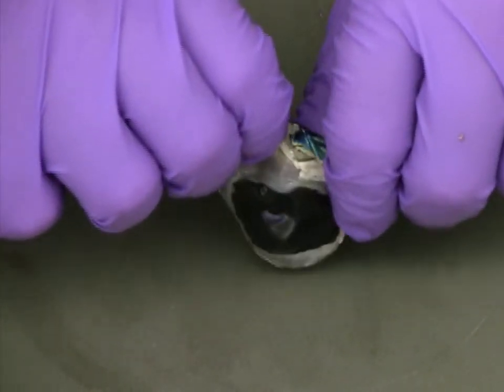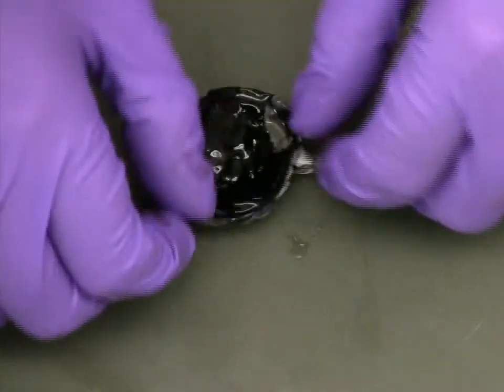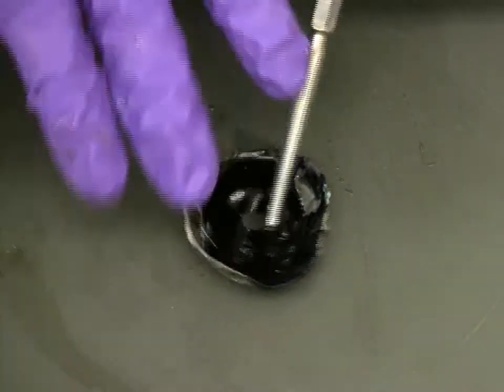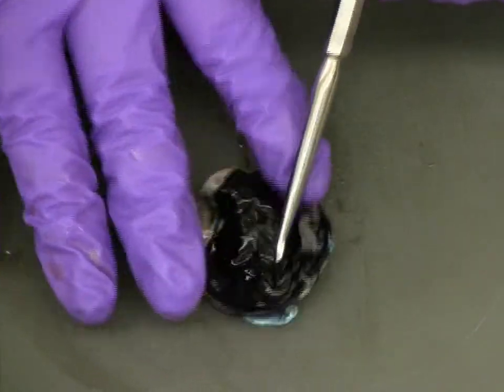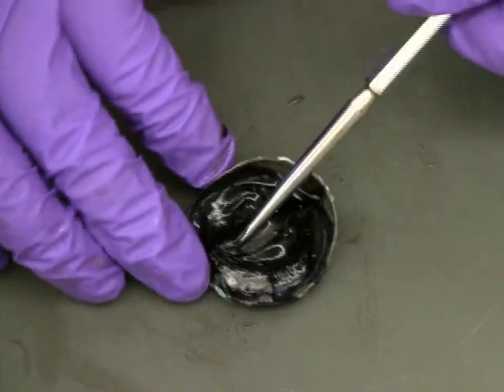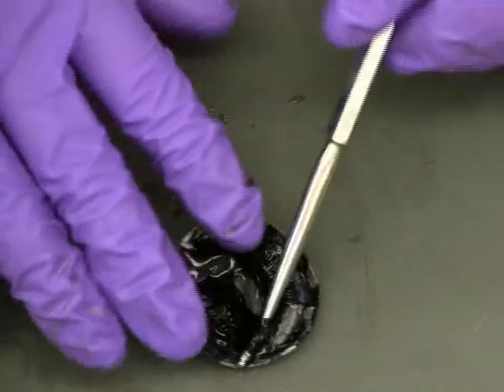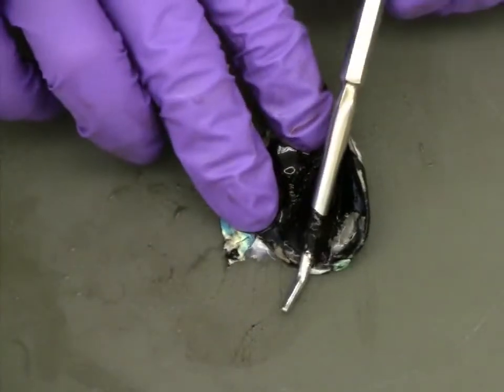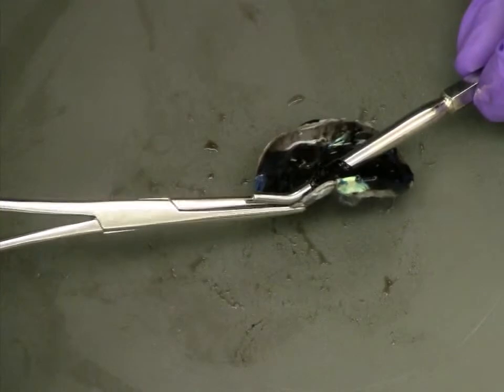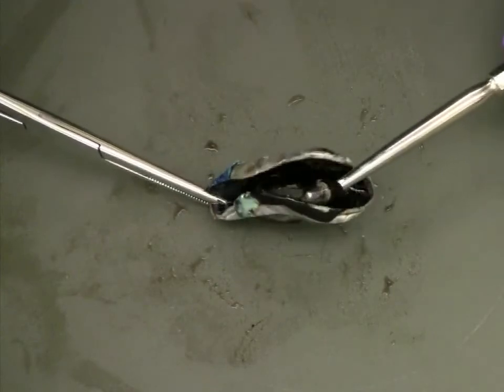With the lens removed, we can now take a closer look at the iris. Using a blunt probe, carefully separate the tissue of the iris from the rest of the eye. If you have trouble getting a good grip while working with the eye, you can use locking forceps or tweezers to hold the eye in place while you slowly pull the muscle tissue of the iris away.